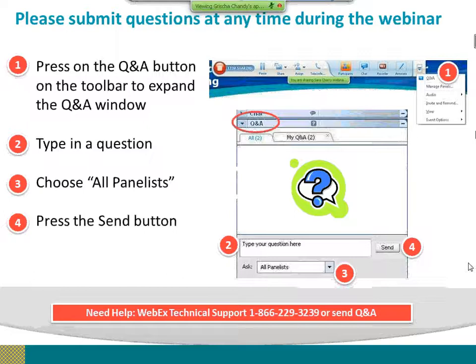That's great. Let me just look at these questions again. In the mitochondrial example, and just as a reminder, your desktop is not shared if you're going to show something. In the mitochondrial example, why did you choose 15 pixels, and is that for the ring of the area around the mitochondria that you want to measure, and is that modifiable?